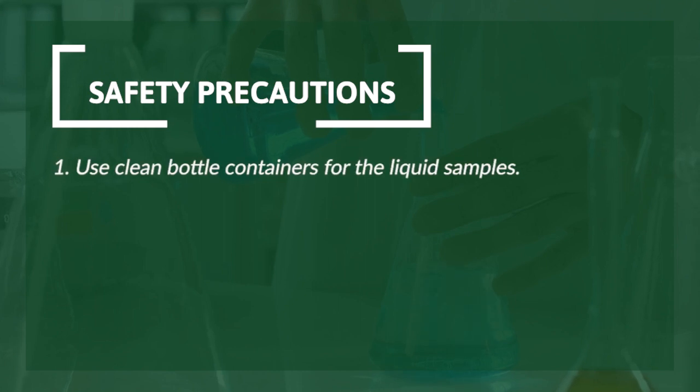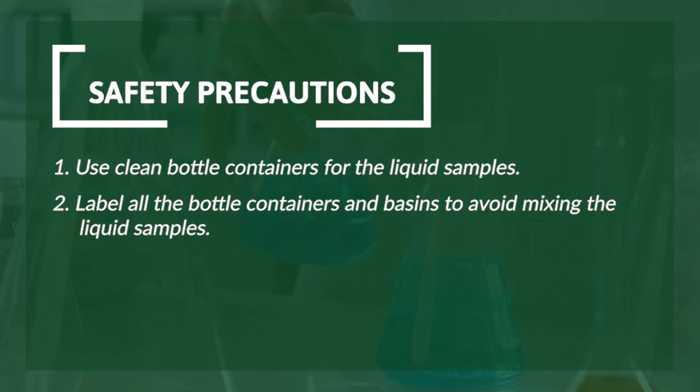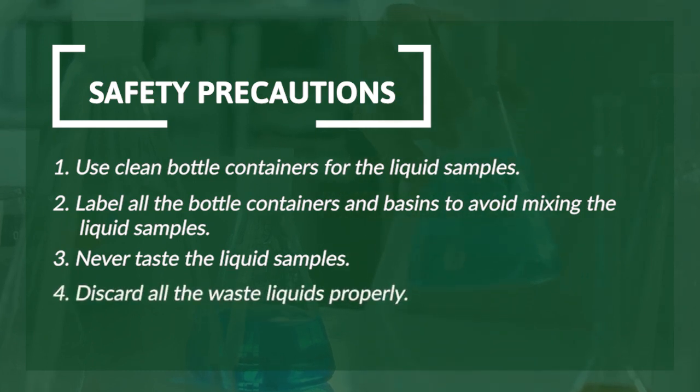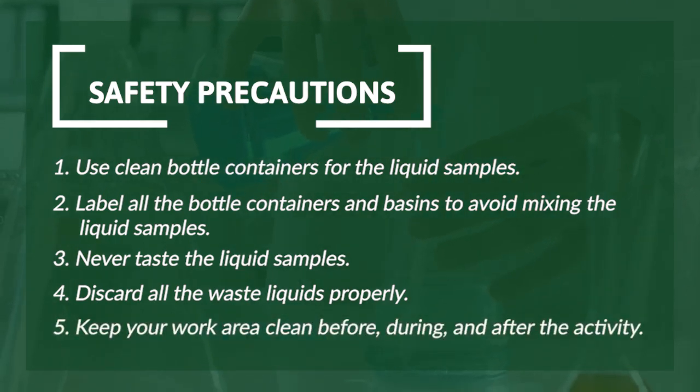First, use clean bottle containers for the liquid samples. Second, label all the bottle containers and basins to avoid mixing the liquid samples. Third, never taste the liquid samples. Fourth, discard all the waste liquids properly. Lastly, keep your work area clean before, during, and after the activity.